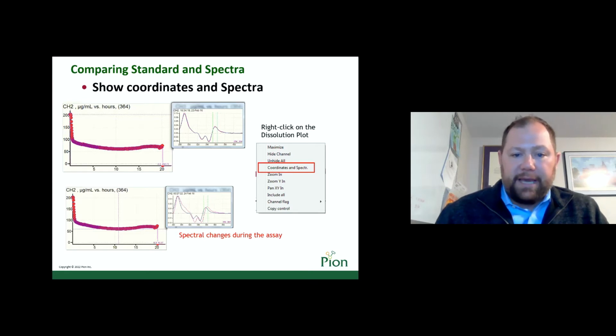Assuming your spectra are well behaved and the standard and sample have the same shaped spectra, you will see perfect overlap and consistent intercept points for the duration of your experiment. Confirming that they have the same zero intercept points within the calculation setting window is a great way to make this comparison. Keep in mind, you can change the display range of the overlay window by adjusting the view settings and choosing a more narrow wavelength region. If you did have a speciation event or you saturated your detector, then you would be able to identify the point in time when that happened, which can be very useful qualitative information.